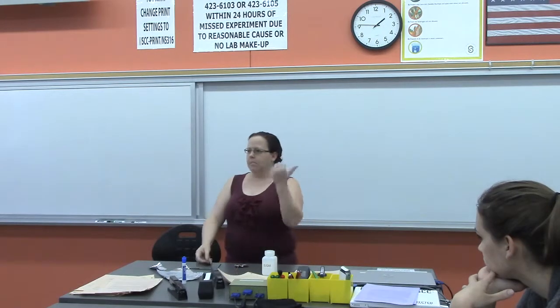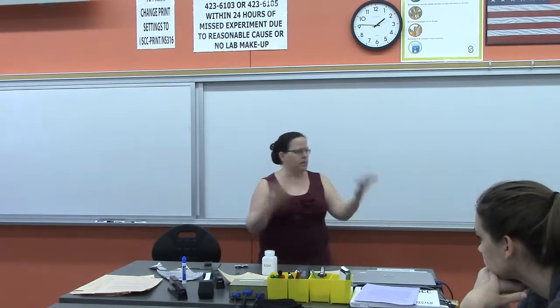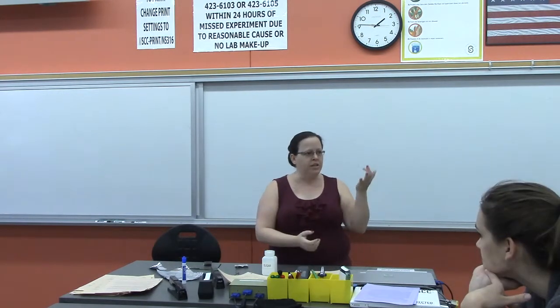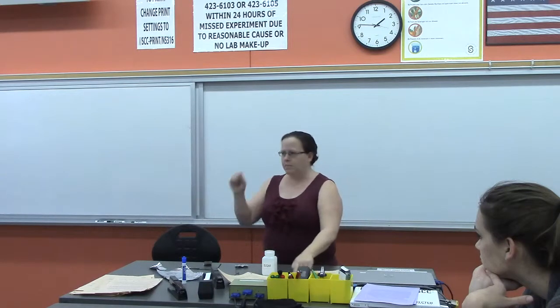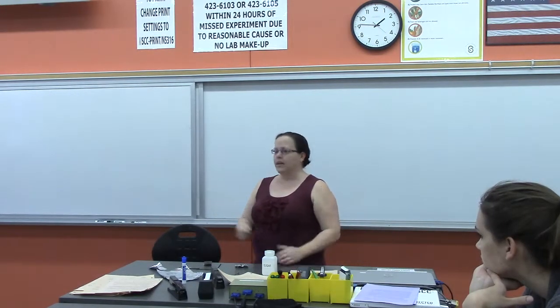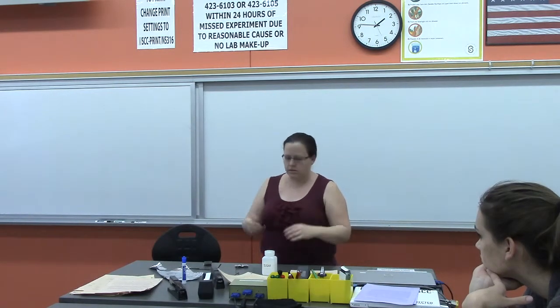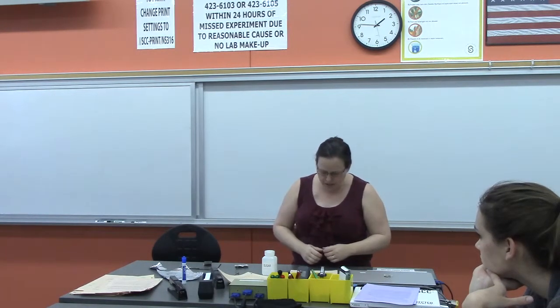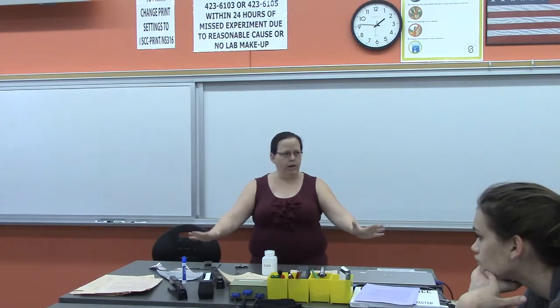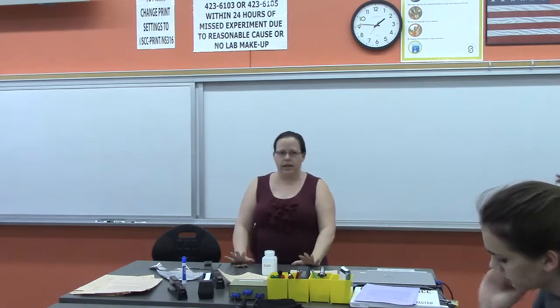Okay? Did it melt? Did it burn? Did it catch fire? Right? Did it seem to decompose, turn black? Were there color changes? Were there smell changes? So we gave you a nice big space under heating to kind of write any little observations you see happening. Did the match just go out? Did nothing happen other than the match went out? That's an indication too, okay? So once we've done that, you're done with part one. You've gotten all your samples, you've made your observations, you've done your heating, we're done.